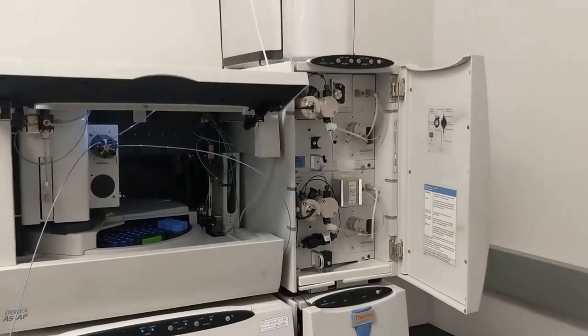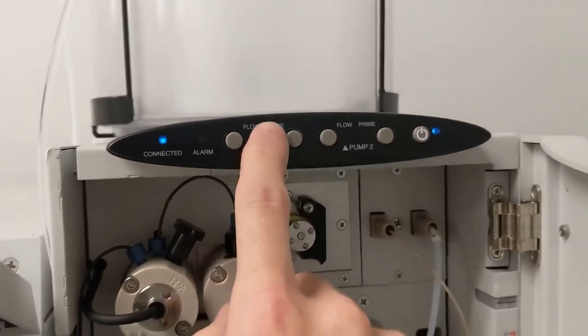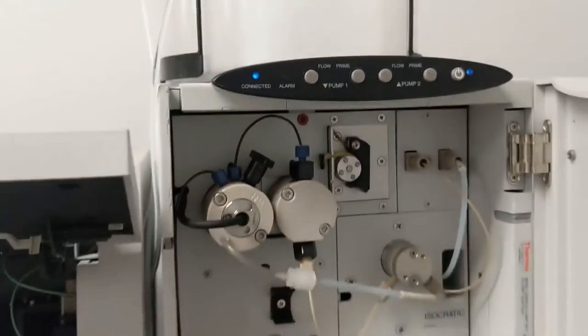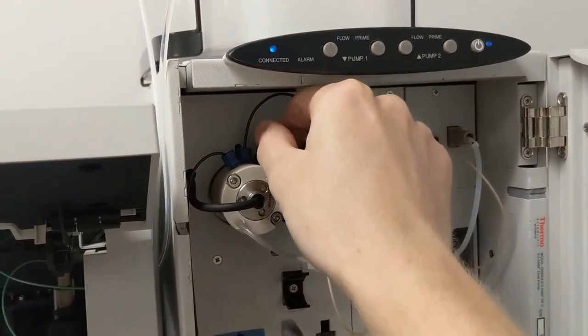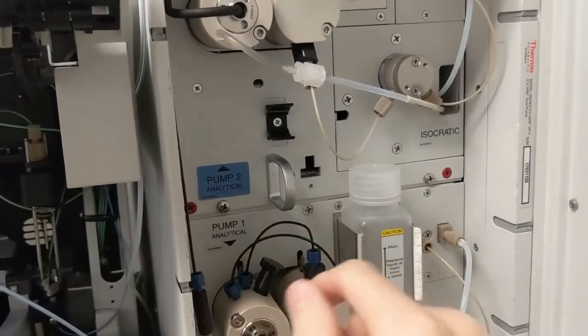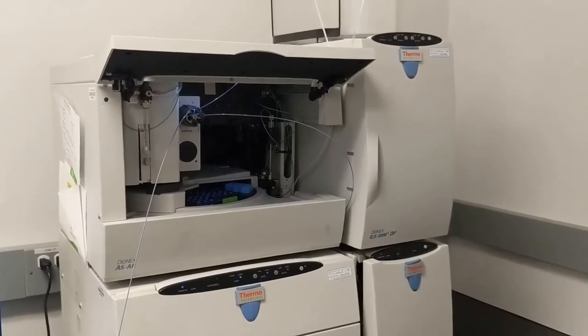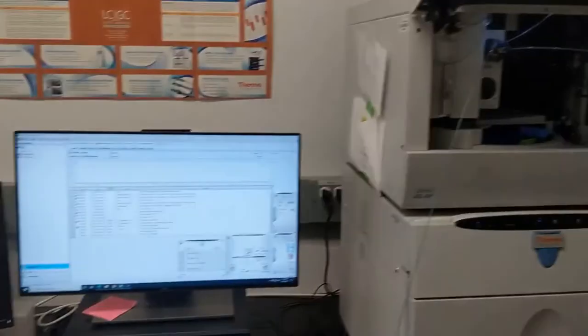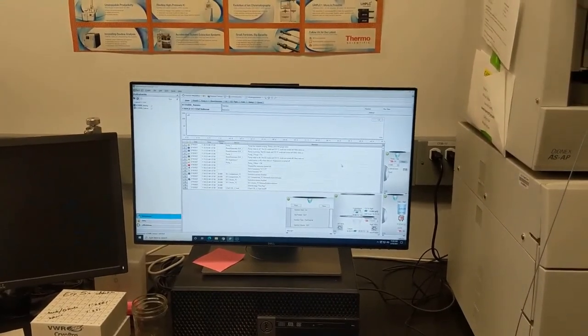Once the pumps have finished priming — you'll know because the little blue prime lights are no longer lit — close the purge valves. You don't want to close these too tight, just enough to be snug, just as soon as it catches. Our pumps are primed, our bottles are filled, and we are now ready to look at the Chromelion software.